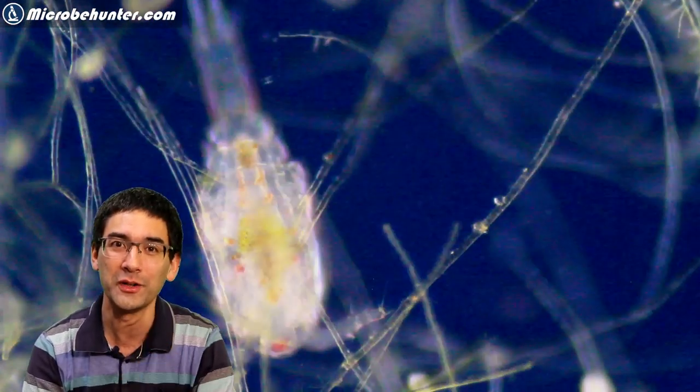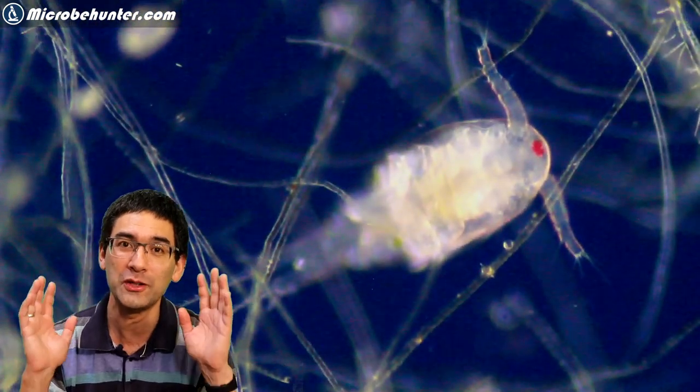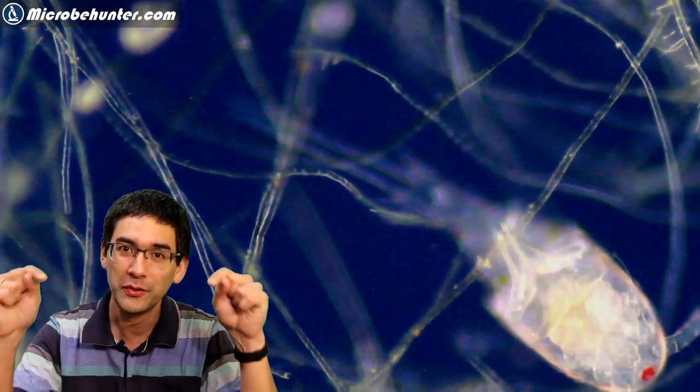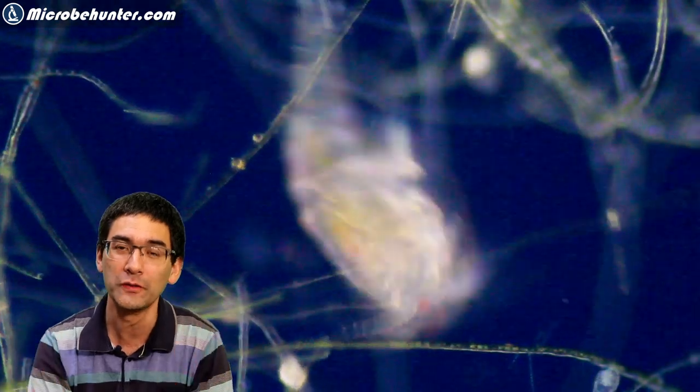Again, another water flea. While we enjoy this little water flea moving around, I'd like to invite you to the description below because I've collected a whole bunch of links.